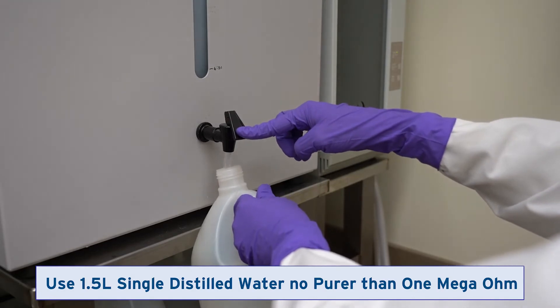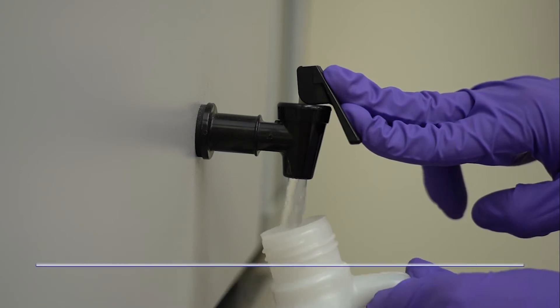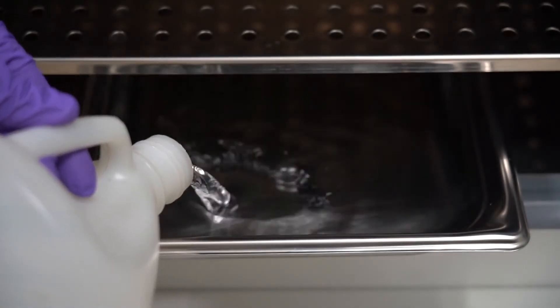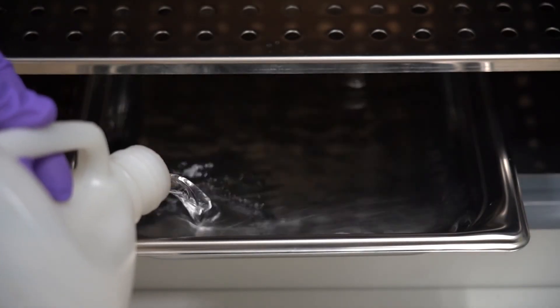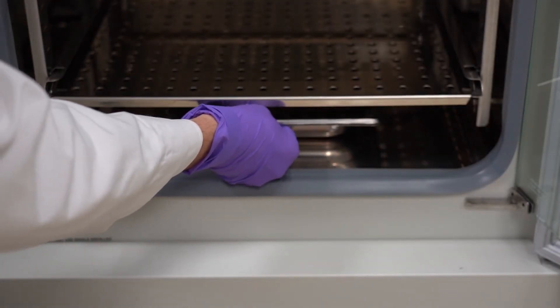Obtain one and a half liters of single distilled water, no purer than one mega ohm. Pour the water into the water pan while it is placed on the bottom of the incubator chamber. Then slide the water pan back to the center of the chamber bottom.